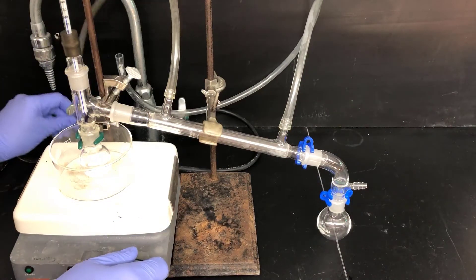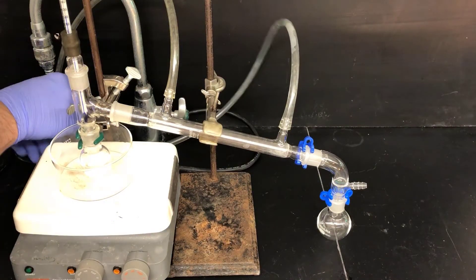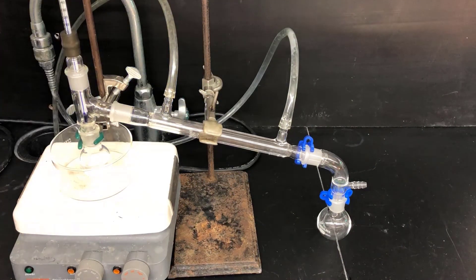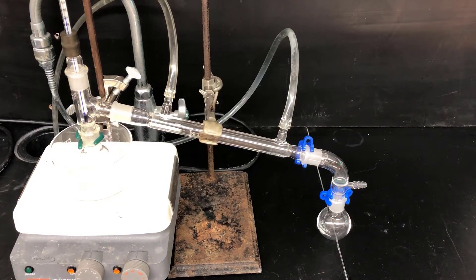Now I'm attaching the condenser hoses. The top hose goes to the drain, while the bottom hose goes to the water inlet. Then I'll turn the faucet on slowly to get the cooling water flowing through the condenser.